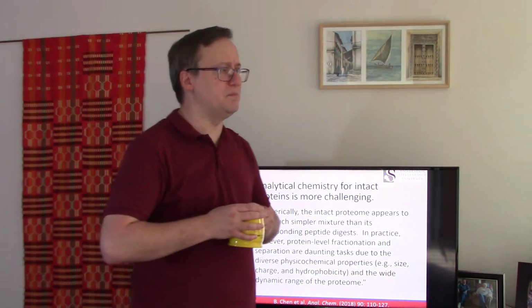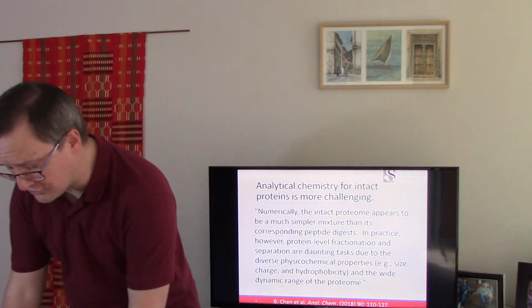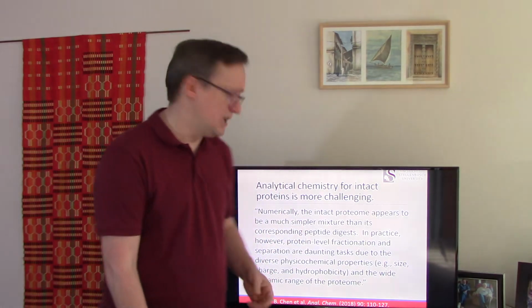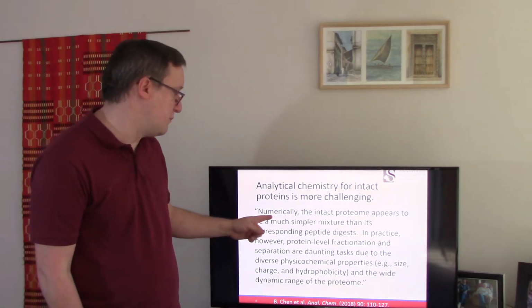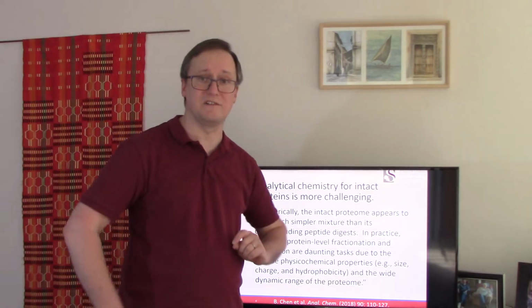Well, if we should be measuring intact proteins, why doesn't everybody do it that way? Why not start there? The answer is that analytical chemistry of intact proteins is frequently much more demanding than of individual peptides. I think this quote kind of has it all from Chen et al. in their 2018 paper: "Numerically, the intact proteome appears to be a much simpler mixture than its corresponding peptide digests."